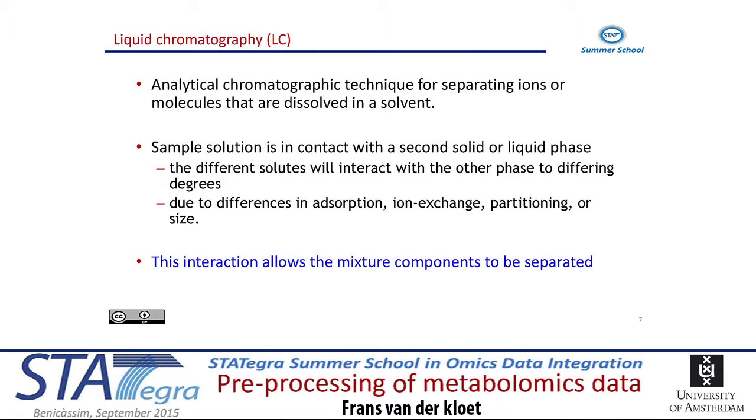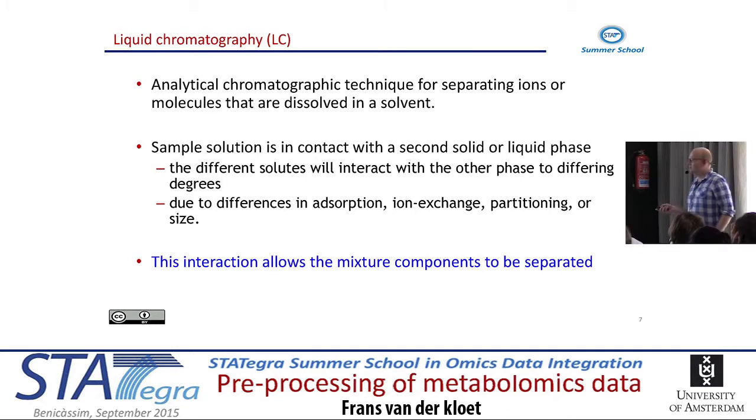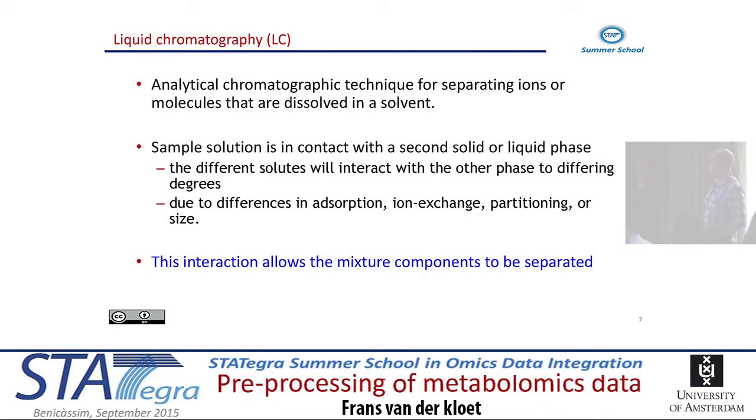So what does liquid chromatography entail in this case? Have all of you done some analysis, like sample preparation? Is anyone familiar with it? Only a few of you. There's a lot that can go wrong with it. I am always surprised by what these analysts can come up with, because I've done it a couple of times myself, and I'm not able to reproduce these results. So it's really hard to do.